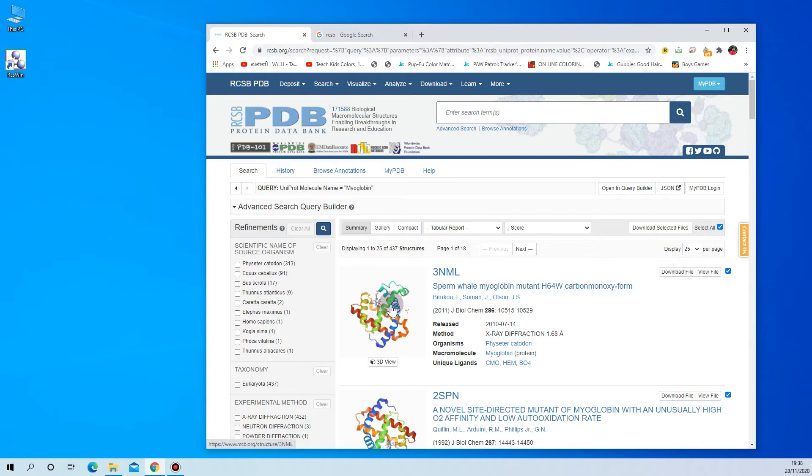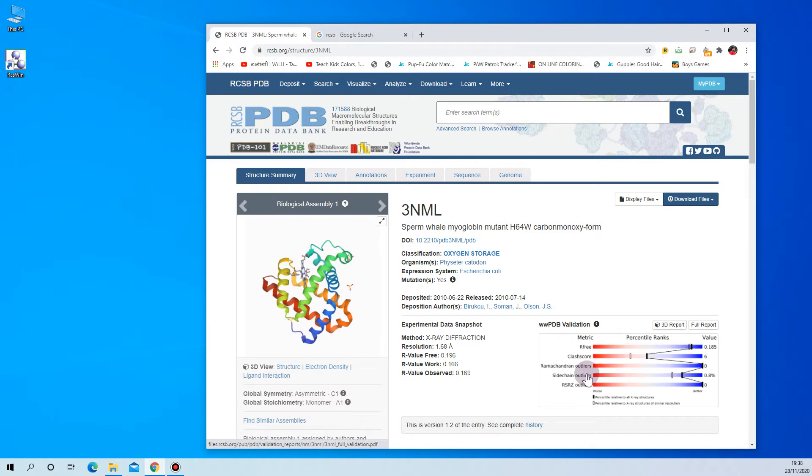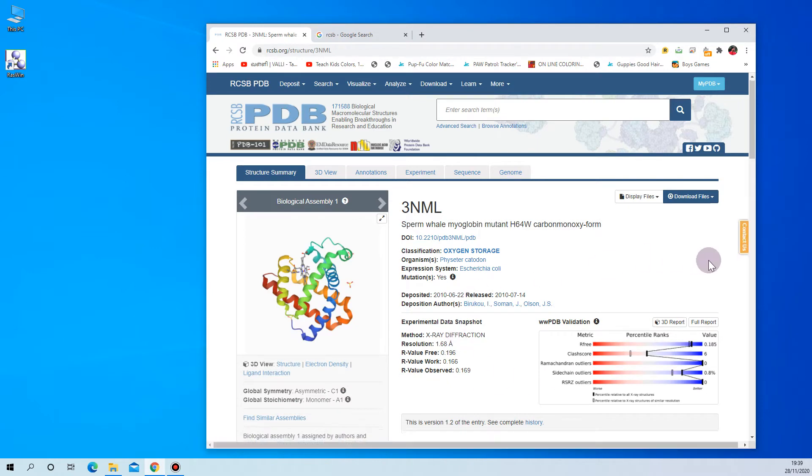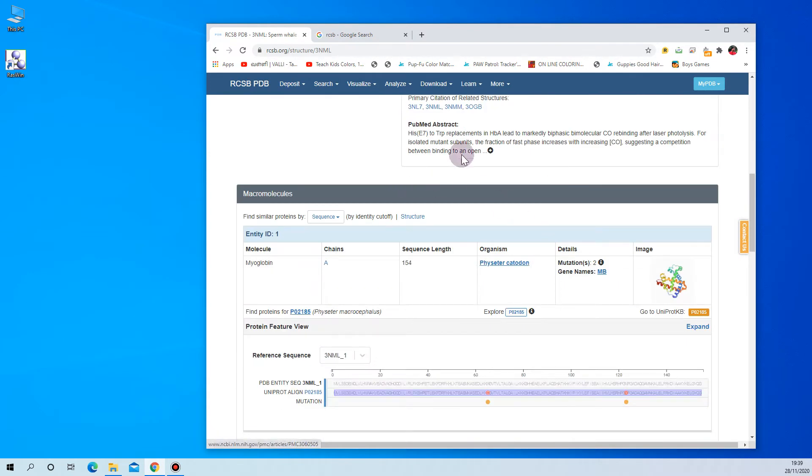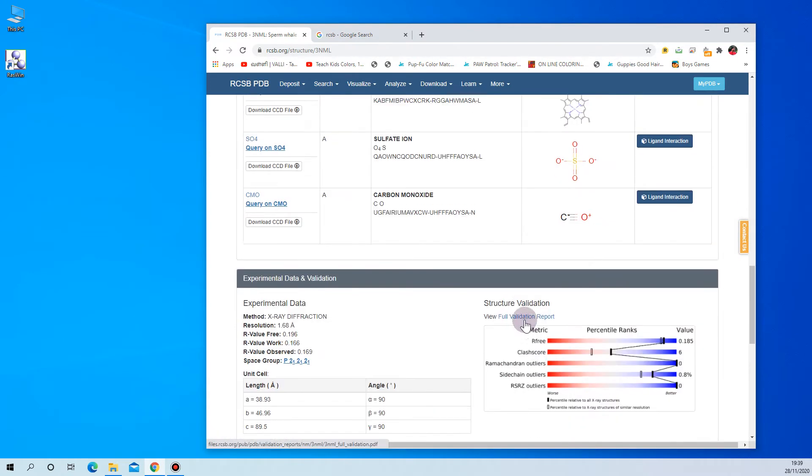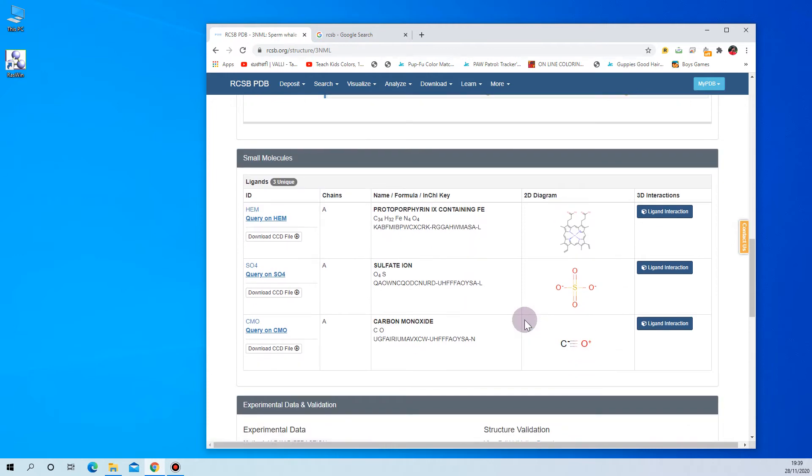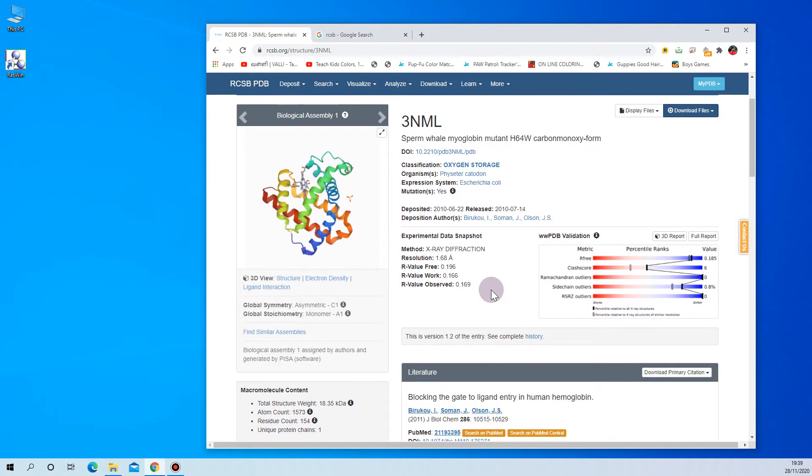and click on the structure so that specific page will be opened. Here you can go through the details. In a further video, I'll explain how we are going to see all of this, what each and every detail means.